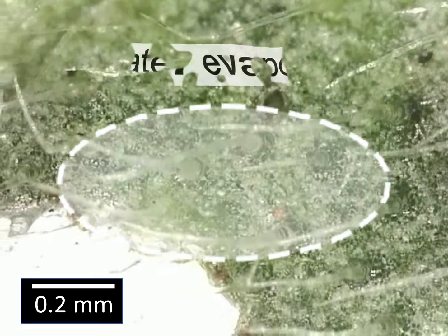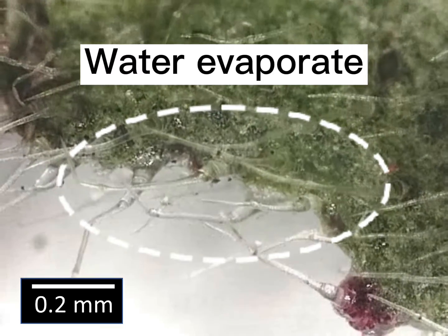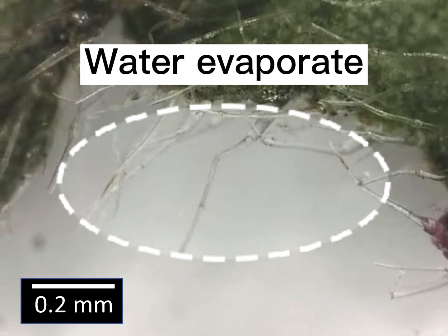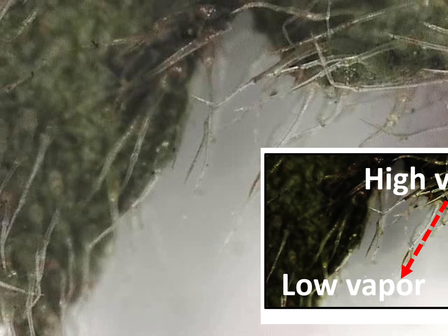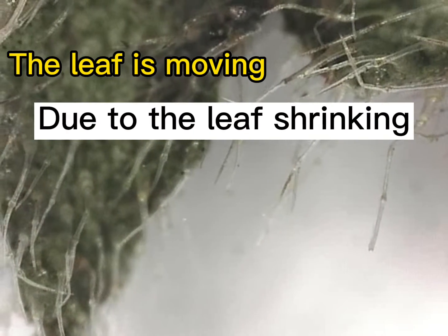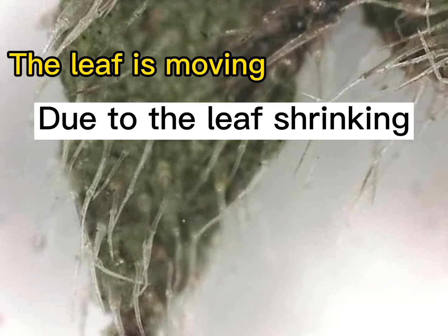As the leaf shrunk, the water slowly evaporated and flowed through the leaf hairs, which could be clearly observed. This is a capillary phenomenon due to the relatively low humidity in the air. It could be seen that the image moved quickly due to the severe shrinkage of the leaves.